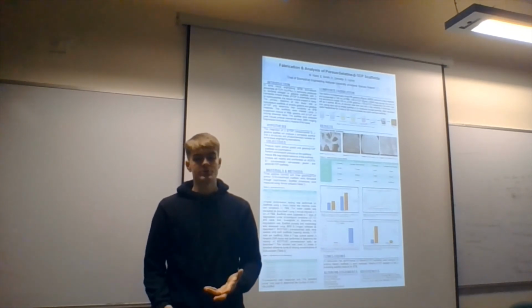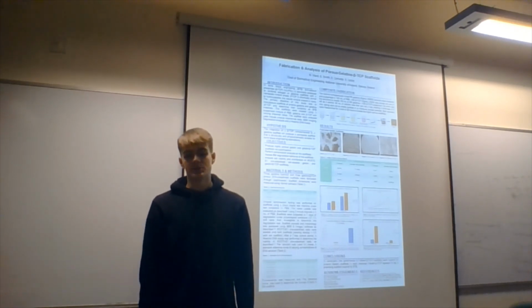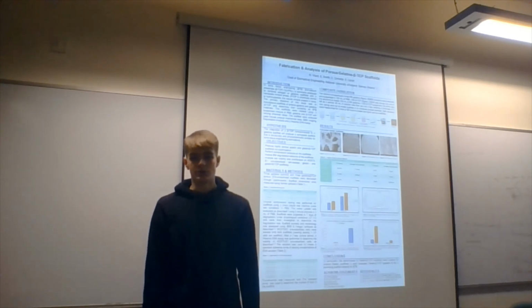In conclusion, the performance of gelatin with beta-TCP scaffolds was far superior to pristine gelatin scaffolds in each analysis. Gelatin with beta-TCP appears to be a promising scaffold material for bone tissue engineering.